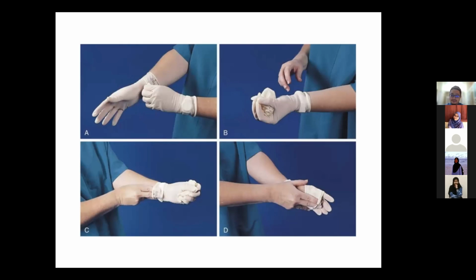You hold it in the palm. Using your already free hand, you put your fingers inside the glove and push. So the side of the glove that has been used will not touch your skin. We will show this again in the lab.